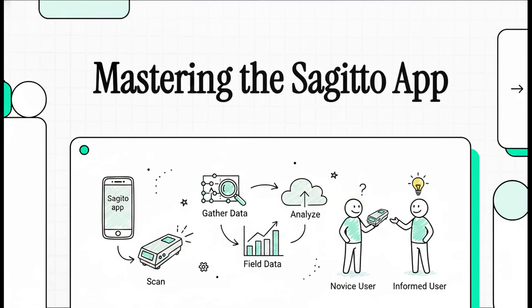Welcome to this explainer. Today, we are jumping right into a complete day-in-the-life workflow of the Sagitto Spectrometer app. Whether you're a total novice gearing up for your very first scan or a seasoned pro confidently analyzing field data, this workflow is designed absolutely for you.